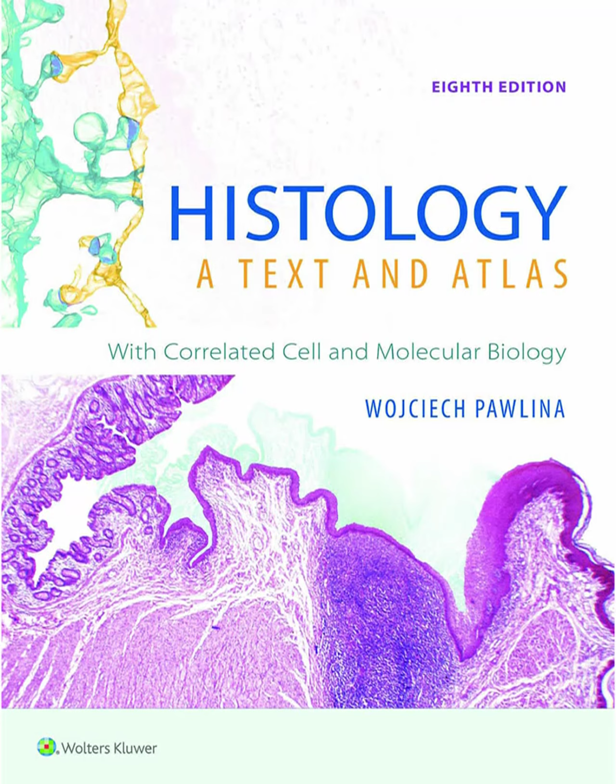Incredible detail with light. But for the ultimate resolution, we still generally turn to electron microscopy, or EM. Using electrons instead of light. Exactly. Electrons have much, much shorter wavelengths than visible light photons. This allows EM to achieve resolutions perhaps 1,000 times greater than light microscopes, down to the sub-nanometer scale in some cases, revealing the ultrastructure of cells. 1,000 times better again.